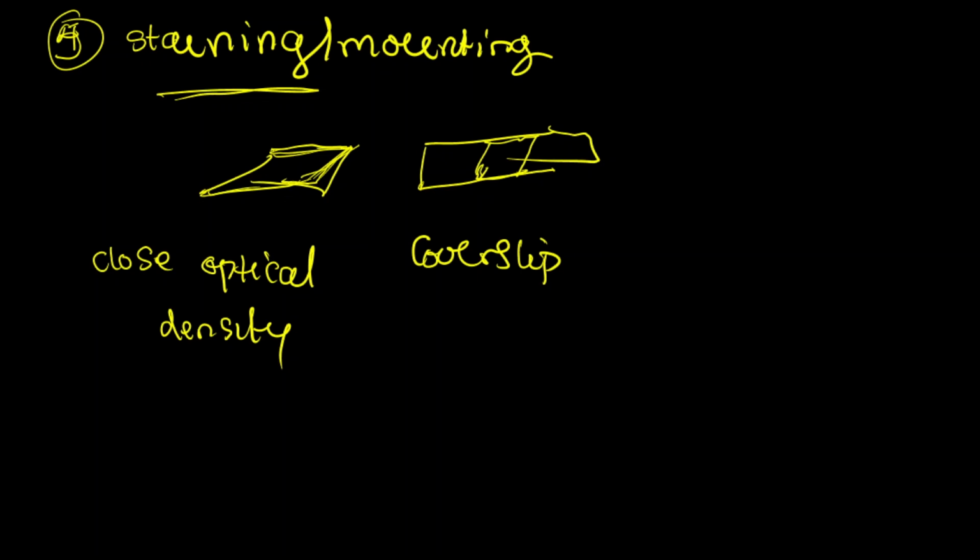However, these stains and these dyes that we have are not soluble in the paraffin. Okay, the stains are not soluble in the paraffin. So how exactly do we stain this tissue slice? Now this is very interesting because we would have to reverse the entire process of paraffin embedding.